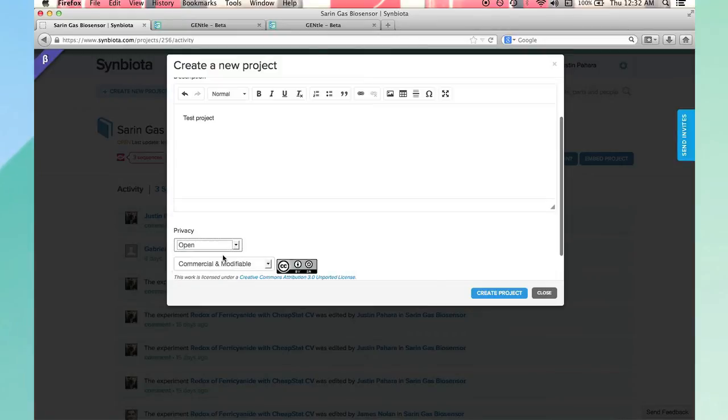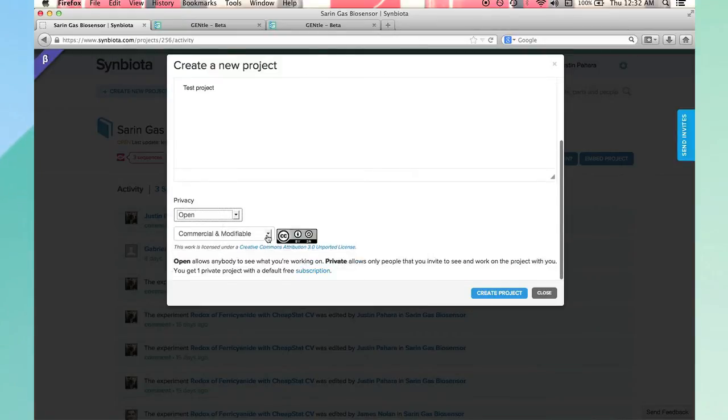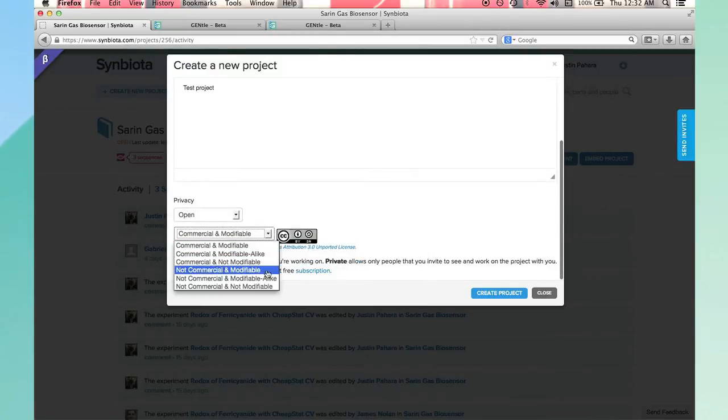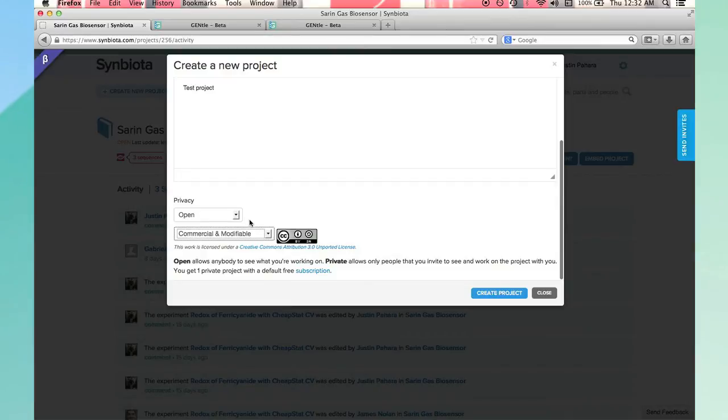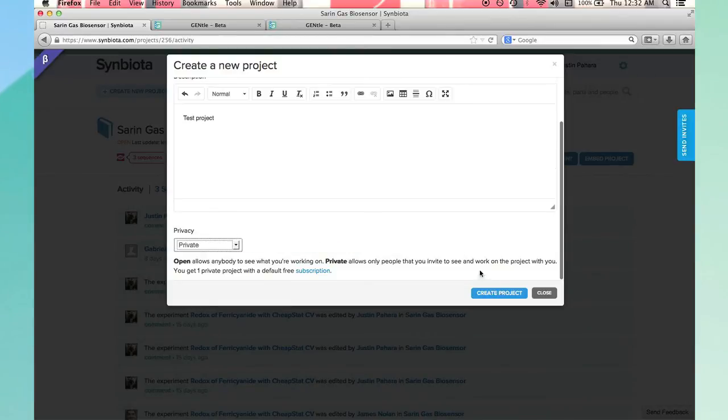If you choose open access, you must choose between one of six Creative Commons licenses. Click to create.